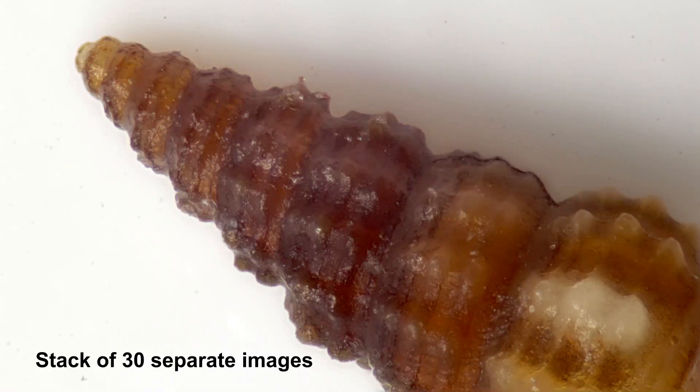Now one of the problems with microscopes is that microscopes have a very narrow depth of field. This means that it's quite likely that even if a specimen is a little bit thicker that it's not possible to have all parts of the specimen in focus so you have to focus back and forth and then the focus changes all the time.